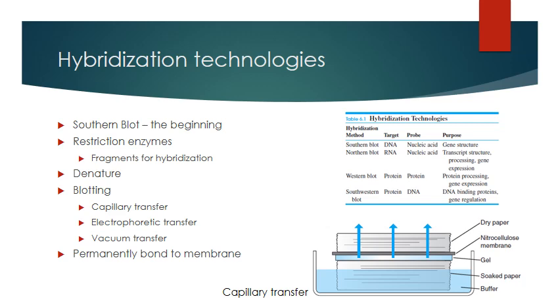We know exactly what the sequence is, so we can produce a probe that is antisense to that sequence, and then we overlay our gel or our nitrocellulose paper with that probe. Usually those probes are tagged with some kind of enzyme or signal, so that we can then cut out the section that has our sequence of interest in it.